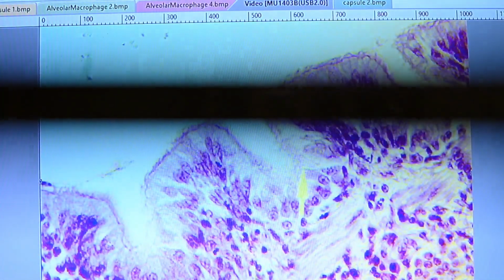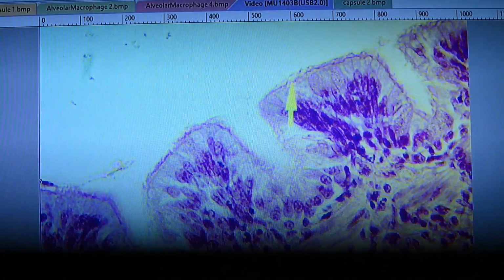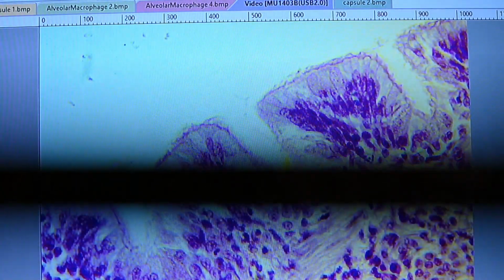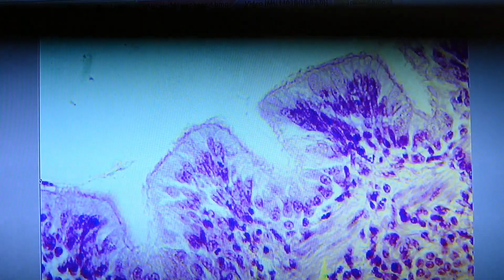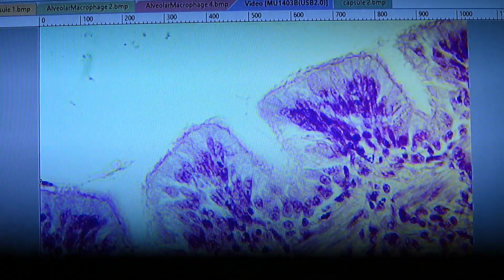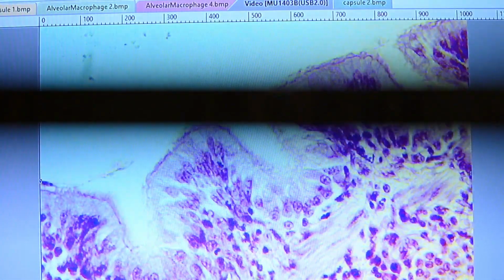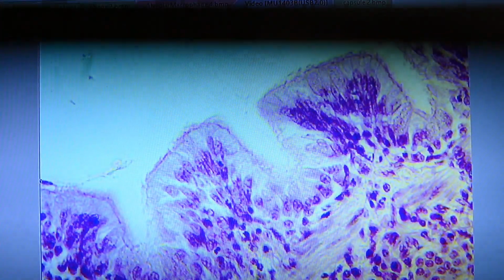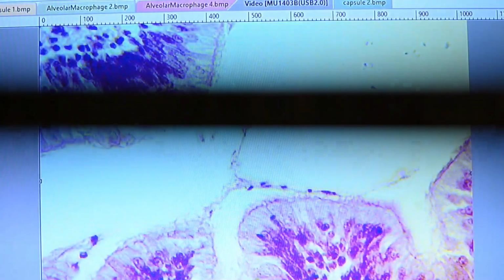Okay, we can see ciliated cells here on the top. We can see there's short little cilia right along that top edge. We see a bit of smooth muscle right here. It's kind of patchy around the outside of this bronchus. A lot of connective tissue with lots of lymphocytes all through here. And then we start to get into these glands. Move into it a little bit.